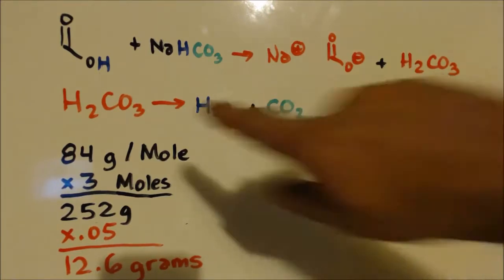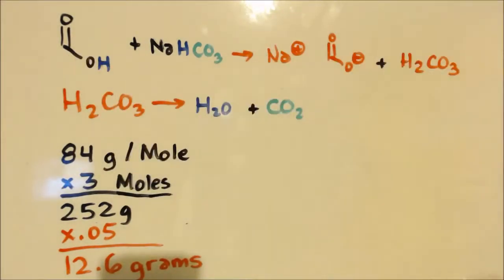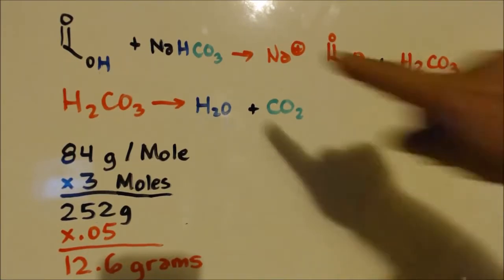That's what this is. This is a carboxylic group. It's one carbon, so it's methanoic acid. And the salt of it would be sodium methanoate. We're going to make it with some baking soda, sodium bicarbonate.